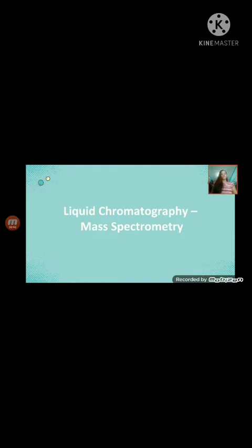Liquid chromatography and mass spectrometry is a component of an analytical chemistry technique that combines the separation capabilities of liquid chromatography, or high performance liquid chromatography (HPLC), with the mass analysis capabilities of mass spectrometry, or MS. Liquid chromatography separates mixtures with multiple components. Mass spectrometry provides a structural identity of the individual components with high molecular specificity and detection sensitivity.